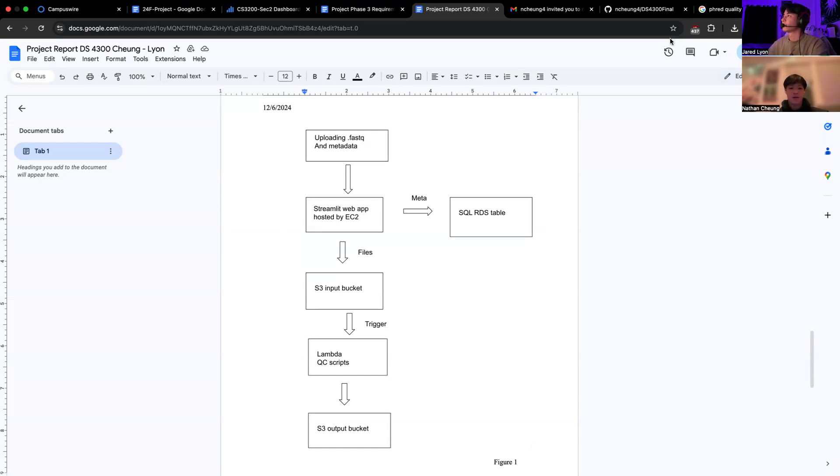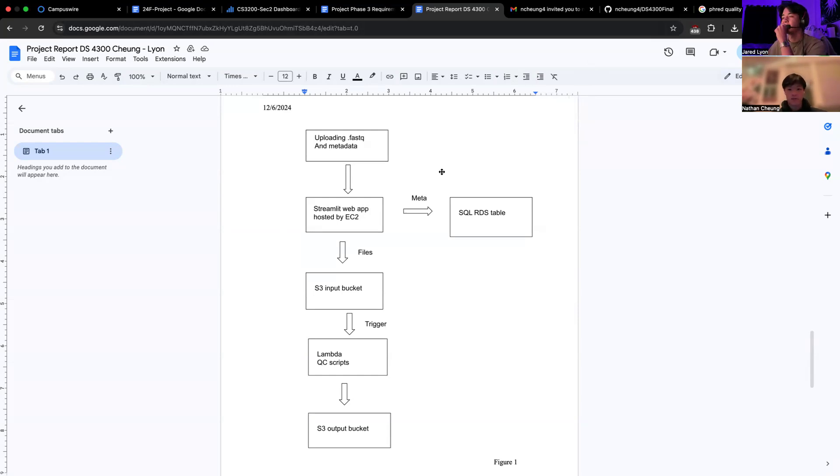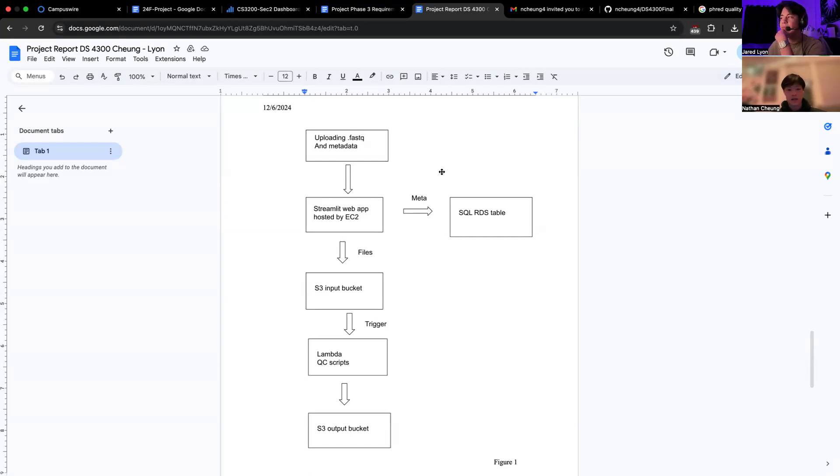Next, we have our file storage in S3 buckets, where we can upload FASTQ files for processing. The metadata entered via this web app is simultaneously written into an Amazon RDS Postgres database.